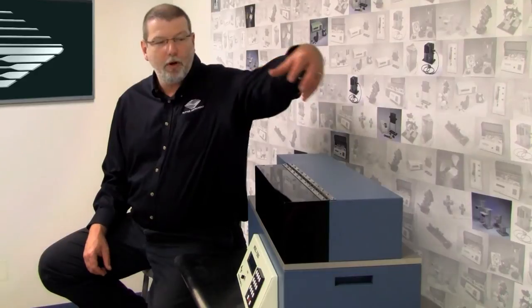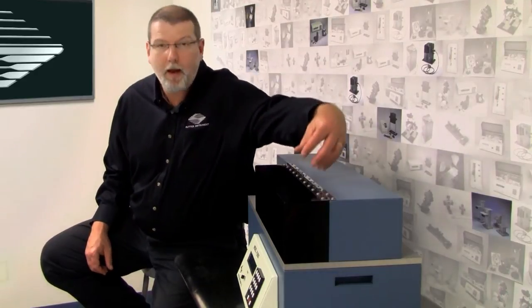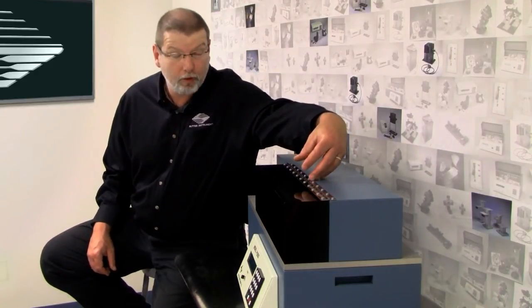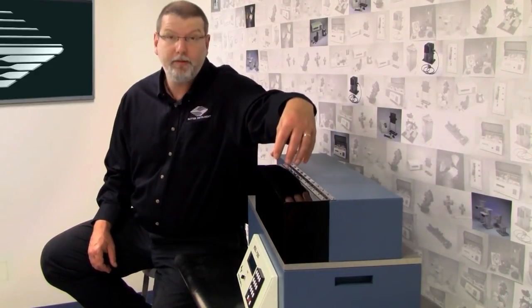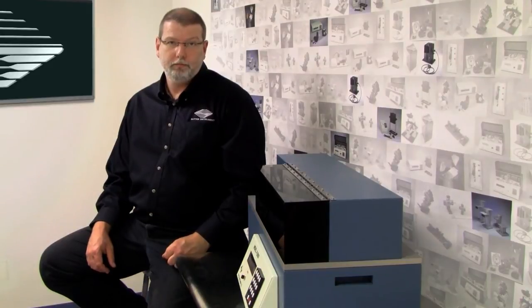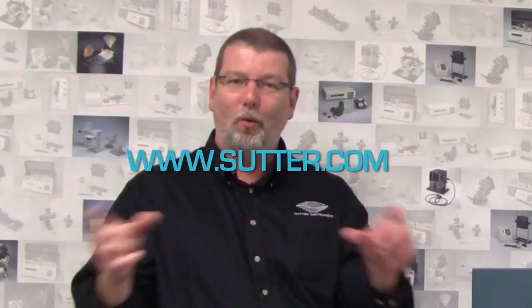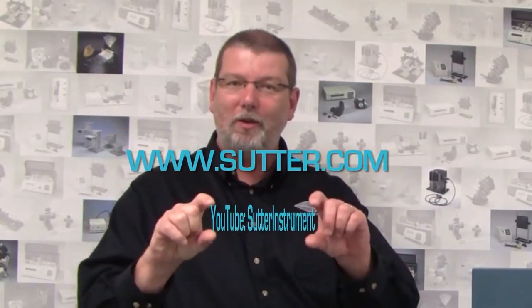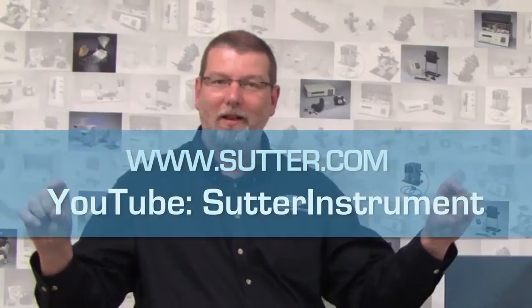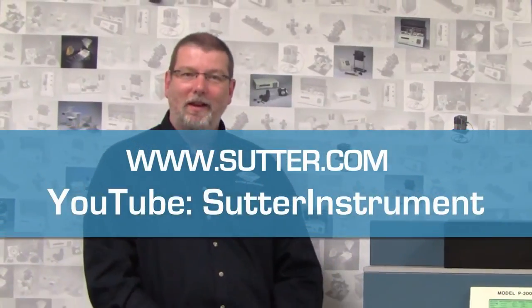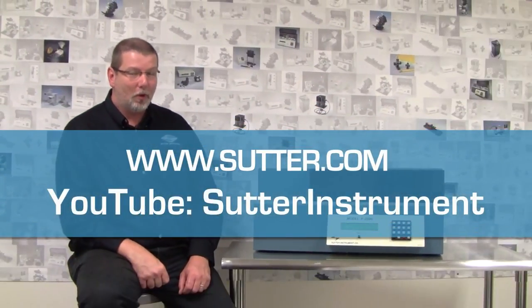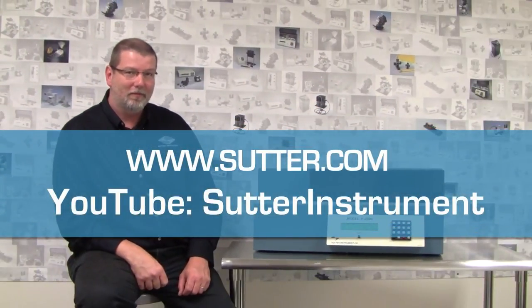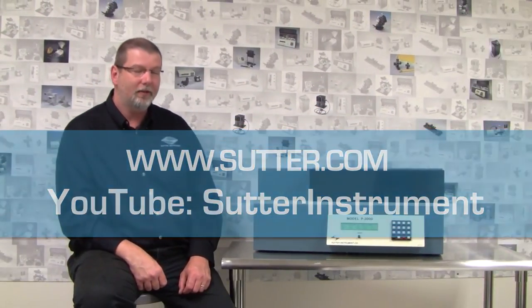We have also produced an introductory video that explains the point of view of the camera in those close-up shots of the pipettes in the process of being pulled. So if you find yourself going, I have no clue what I'm looking at here, go to our website or take a look at our YouTube channel.